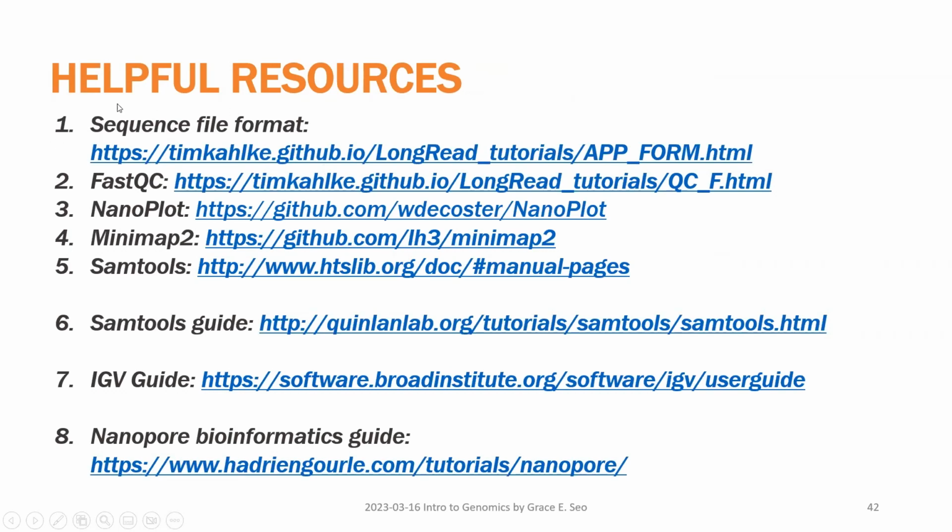For sequence files and file formats, different tools always have some kind of guide or manual on GitHub. When the programmer first develops the program, they would most likely try to put up a manual so people can use it more easily. So these are just some helpful resources relevant to today's workshop, but there's more, honestly. If you find something more interesting or more useful, that's definitely the better guide. Feel free to use those.